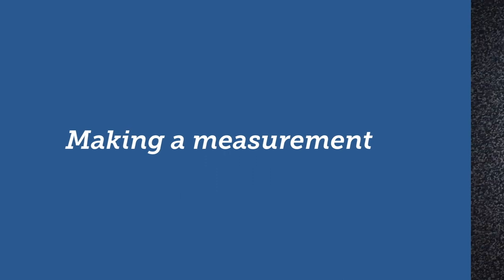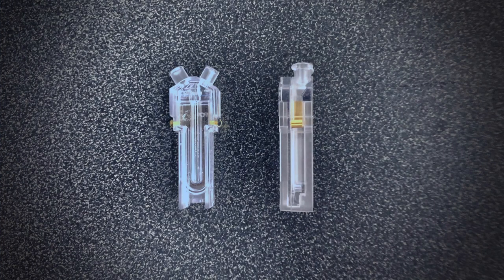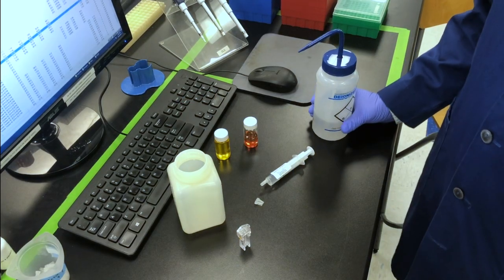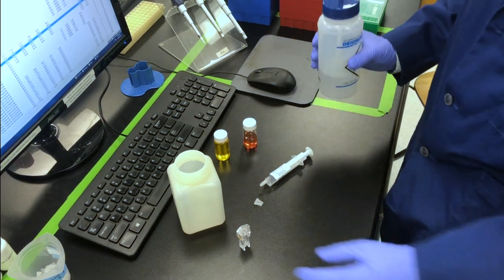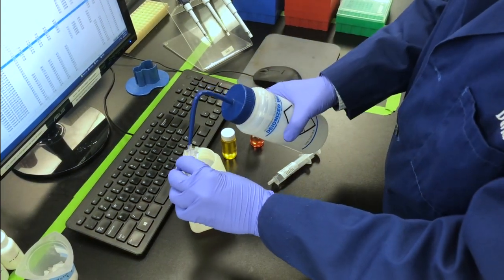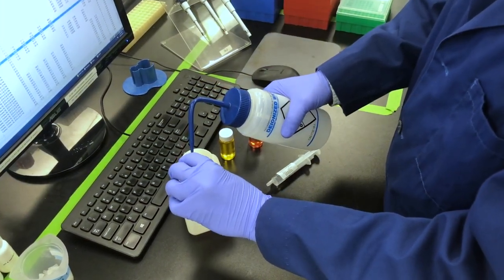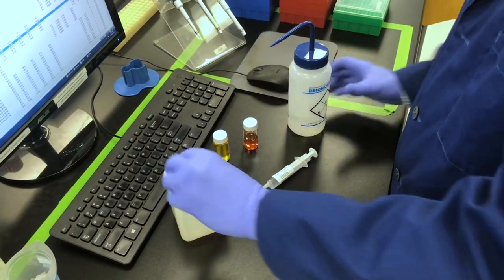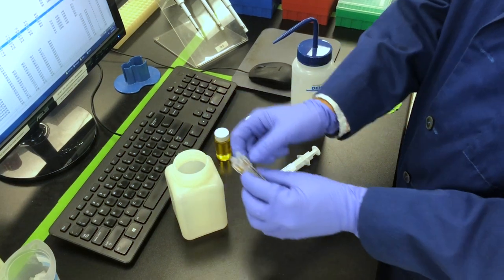We will be performing this demo with Malvern's most commonly used consumable product for zeta analysis, the folded capillary cell part number DTS 1070. Firstly, be sure to use some deionized water to rinse the cell of any dust, residual sample, or contamination from previous uses. After rinsing, give the cell a light shake and a tap to make sure that the water has been cleared out of the cell.